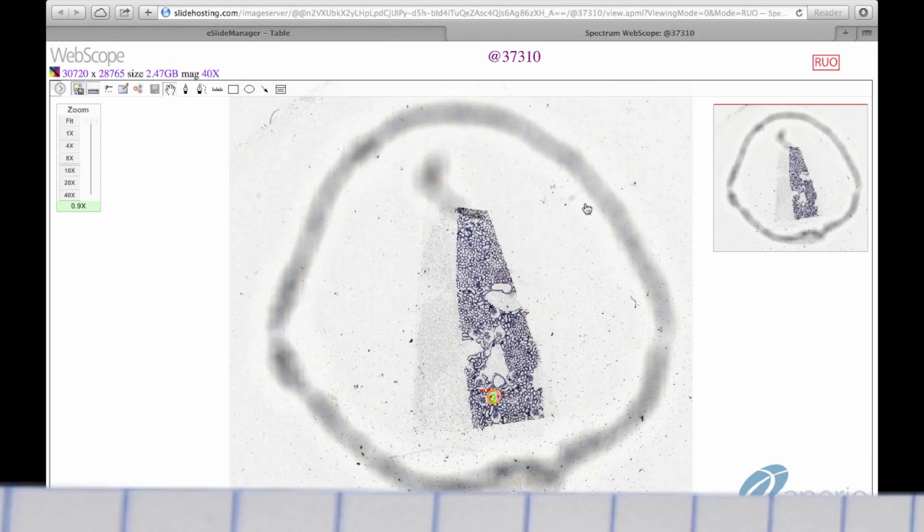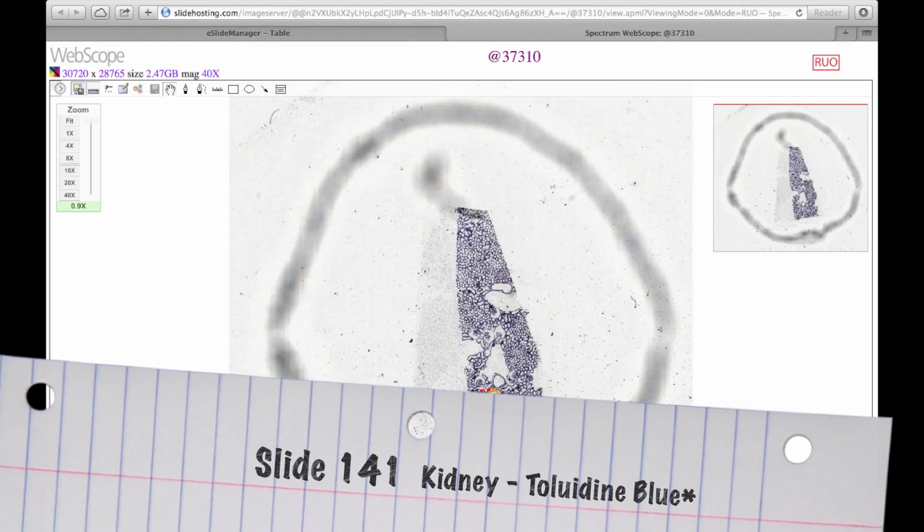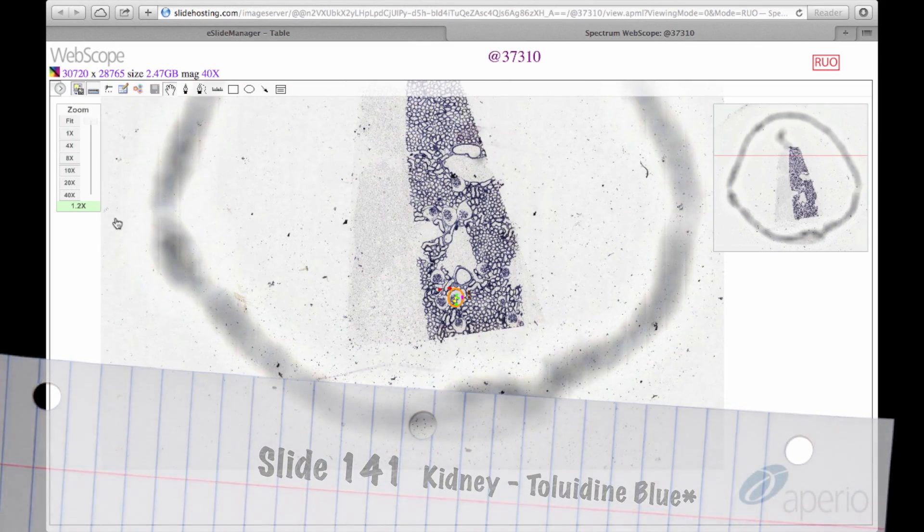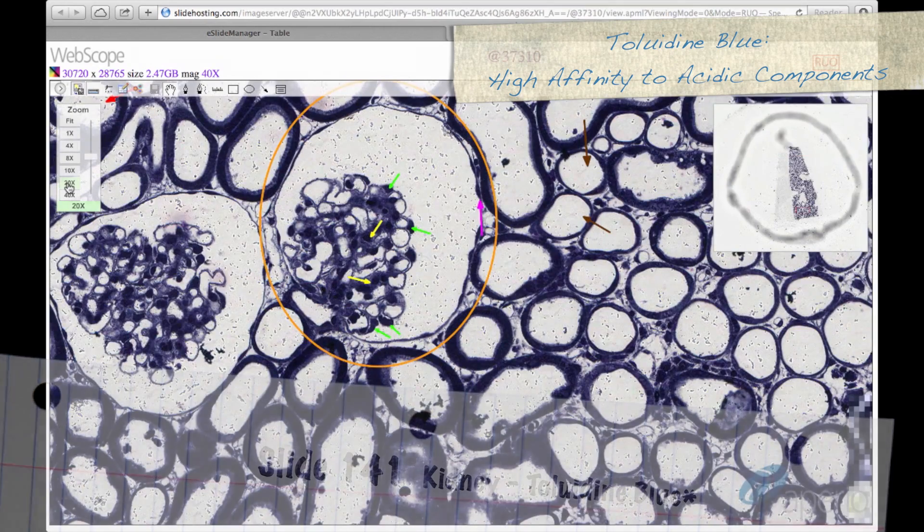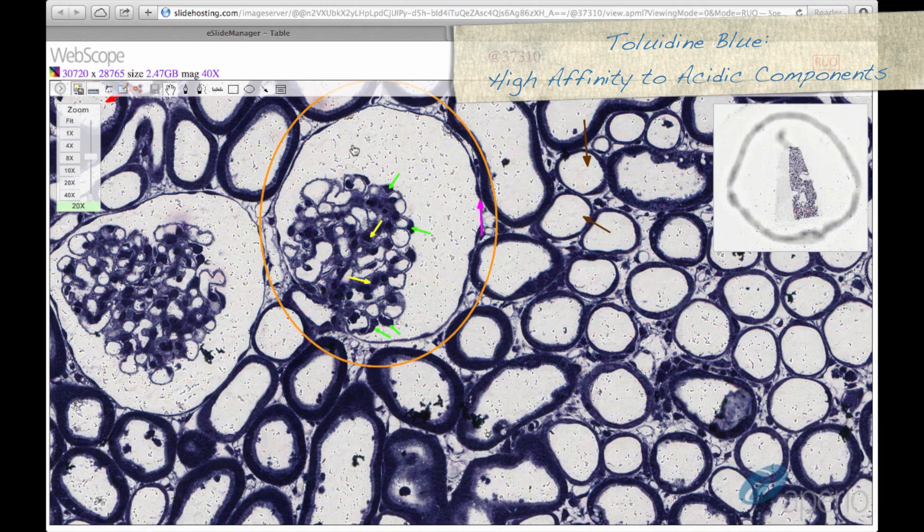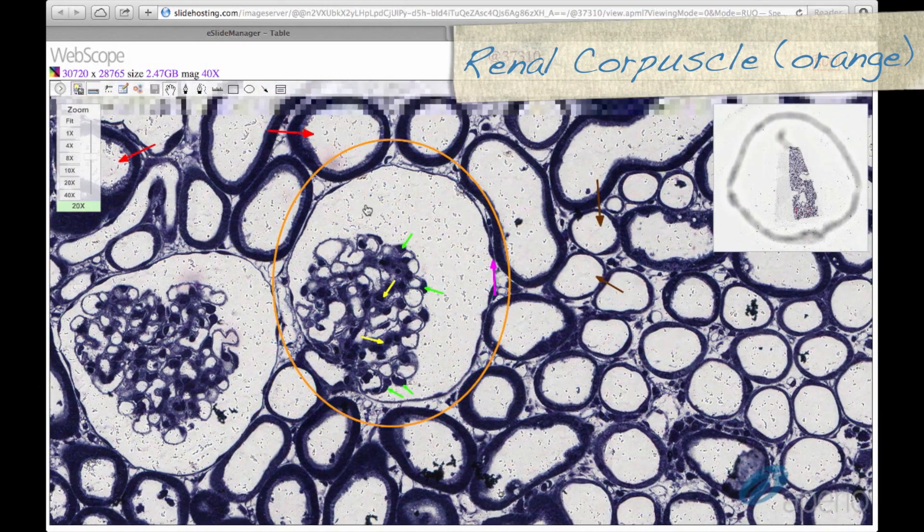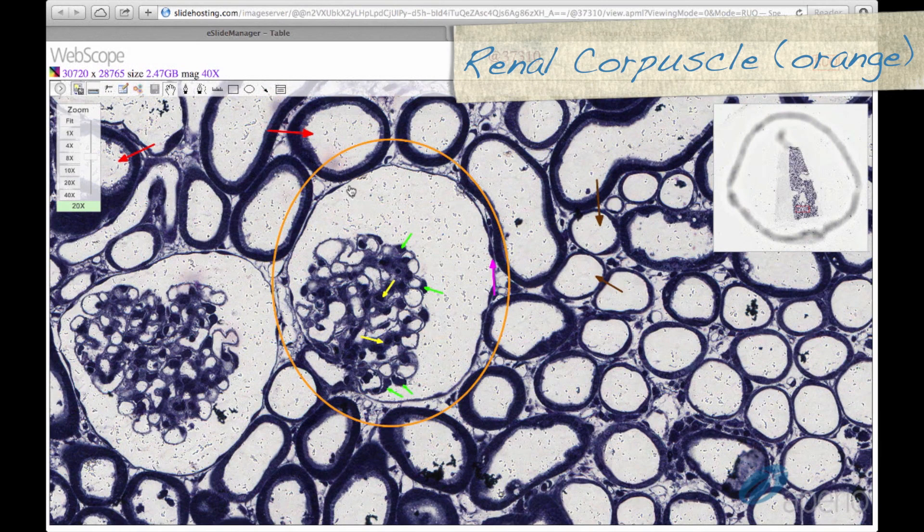We have now moved to slide 141, which is a section of kidney stained with toluidine blue, which has an extremely high affinity for acidic components of tissue. Again, we can find the renal corpuscle, circled here in orange. This stain allows us to identify the cell types located within the renal corpuscle.